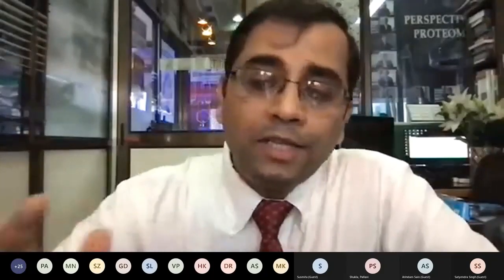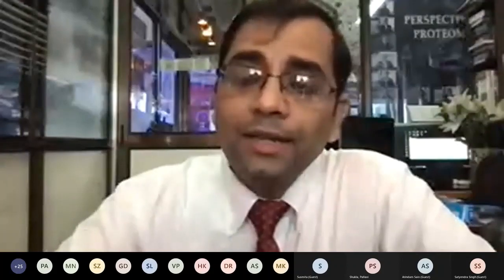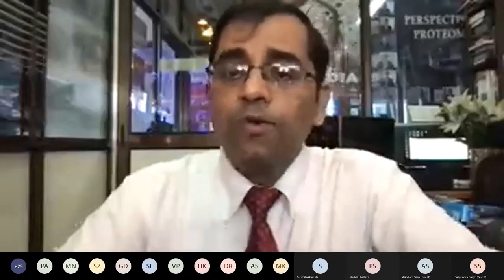And now we are moving more into workshop mode to give you an idea of the practical aspects of doing proteomics and how to take these workflows forward. Whatever we are doing today and tomorrow will be in a theme: we prepare the samples, perform quality control checks, take them forward for gel-based proteomics, and eventually take the same samples for mass spectrometry-based identification and quantification workflows. That's all for this lecture and this session.